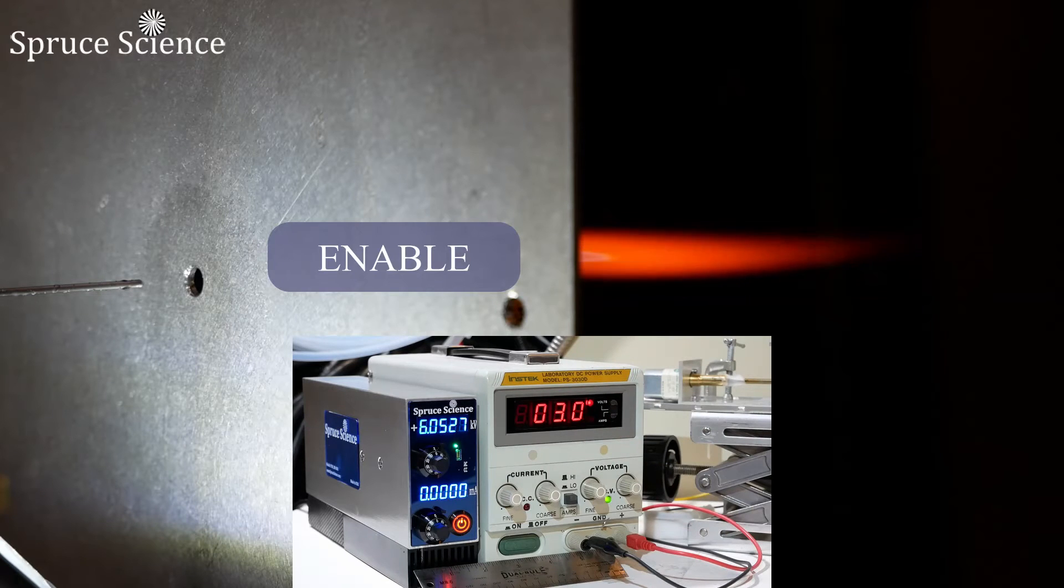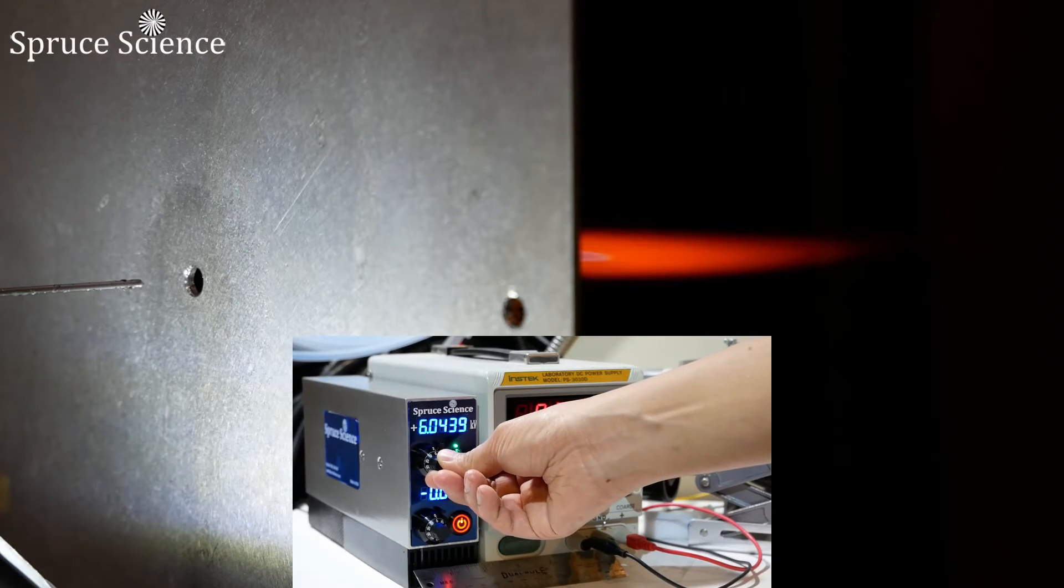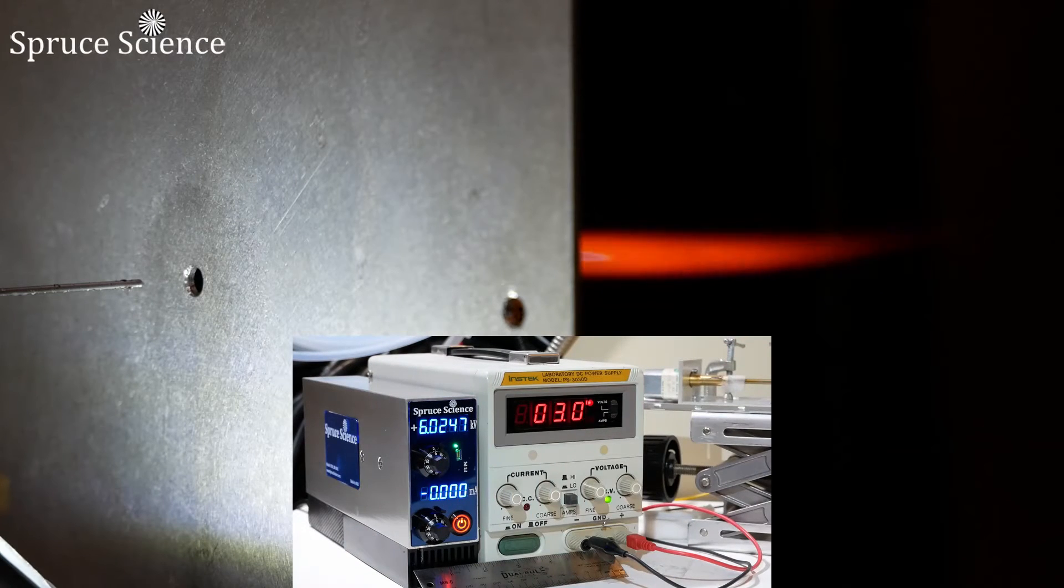As you can see, the flame color changes because thermal energy excites the sample molecules to a higher energy state and their transition back to a lower energy state leads to photon emission with unique wavelengths that are characteristic of the sample molecule.